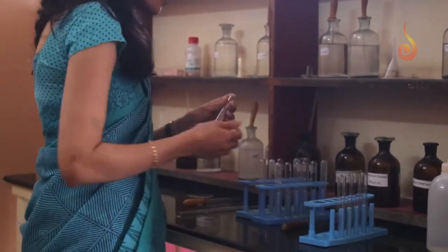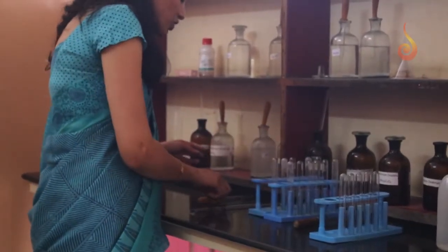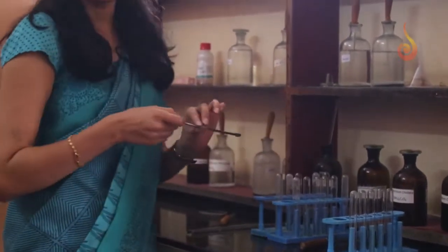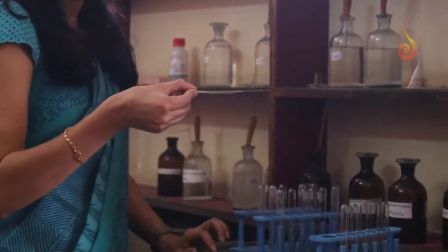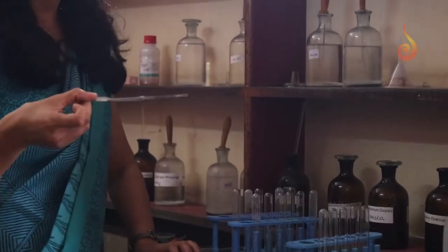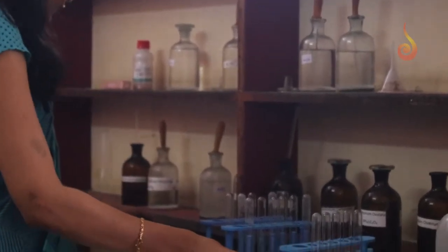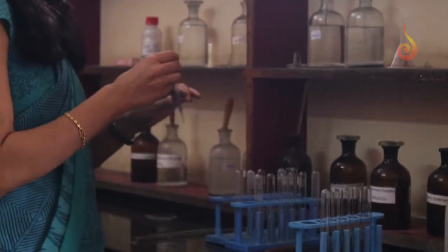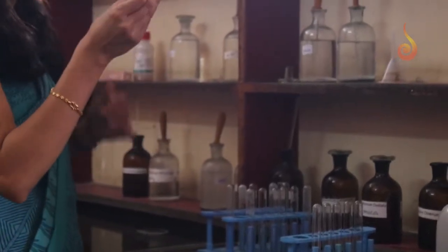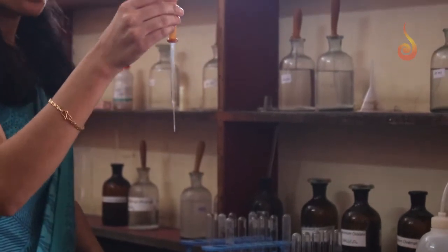Then apart from the test tube rack and test tube holder, to take the inorganic substance we use one more apparatus, nothing but a spatula.